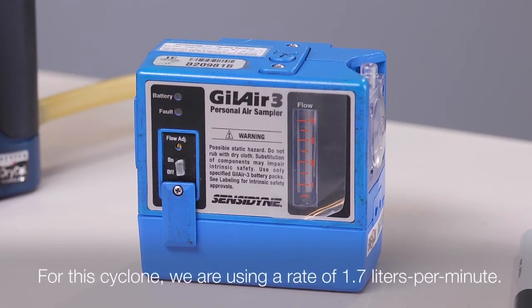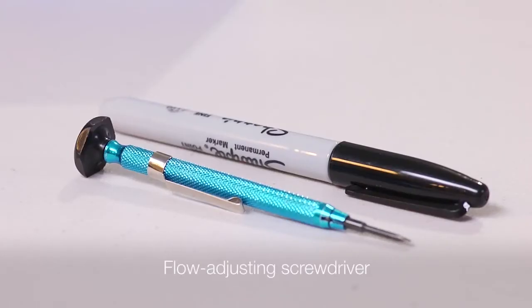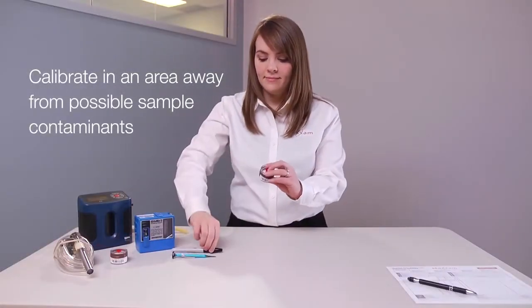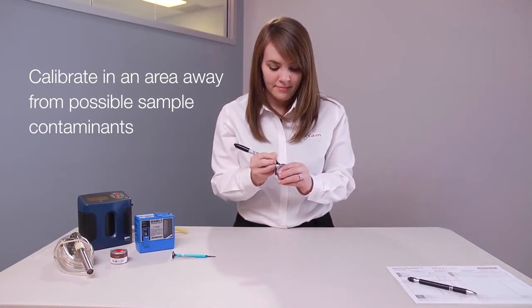For this demonstration, we are using a rate of 1.7 liters per minute, along with a piston calibrator and flow adjusting screwdriver. Calibrate in an area away from possible sample contaminants and label your cassette for calibration.